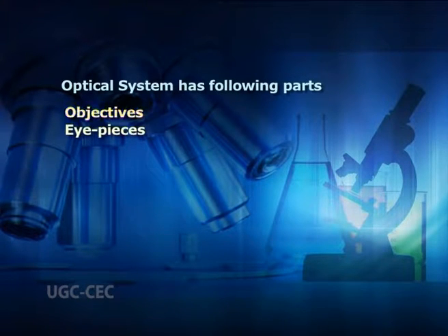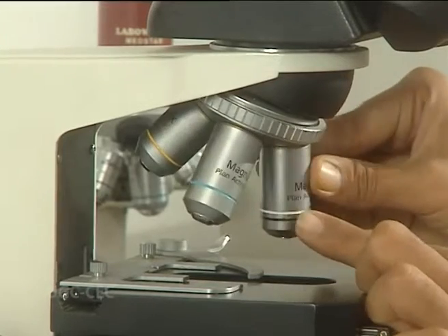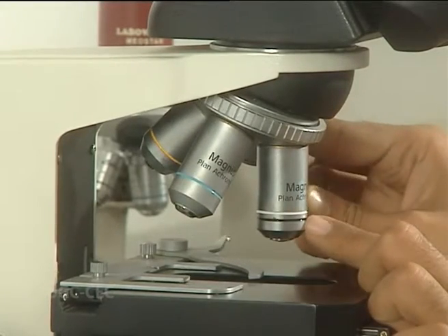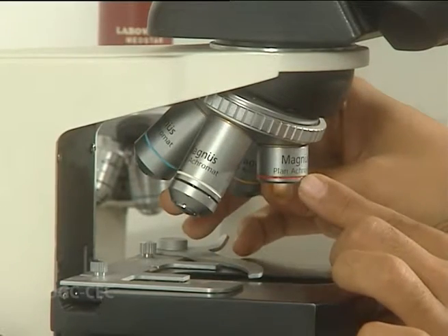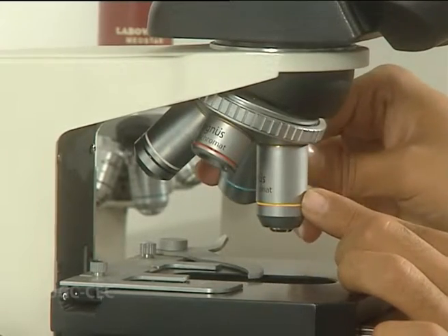It includes objectives. The image of the specimen first passes through the objective. Objectives with magnifying power 4x, 10x, 40x and 100x are commonly used. The magnifying power is marked on the lenses and is usually color coded for easy identification. The numerical aperture is the measure of light gathering power of a lens. The numerical aperture corresponding to the various magnifying powers of the objective is different.